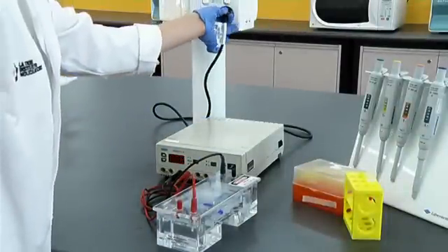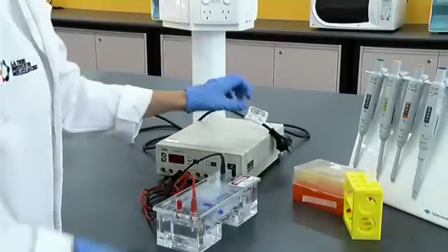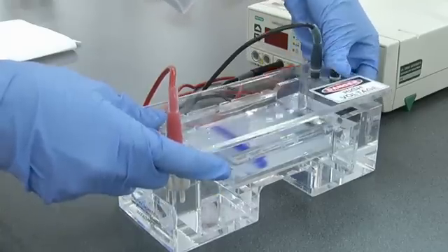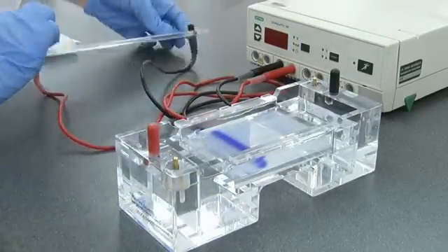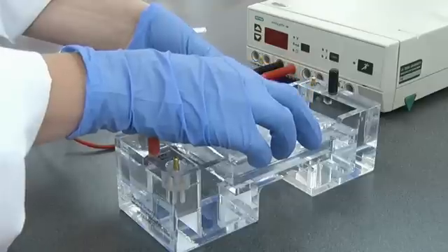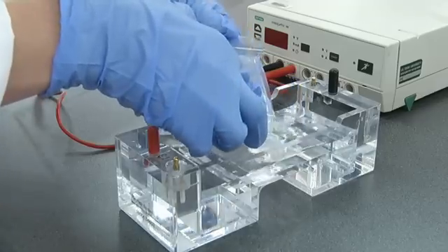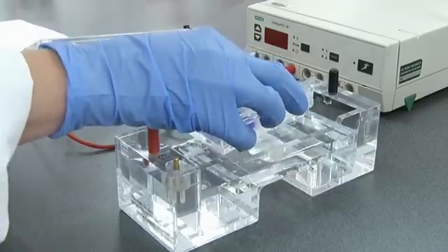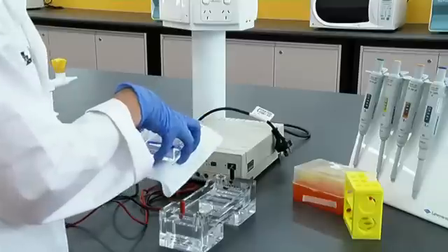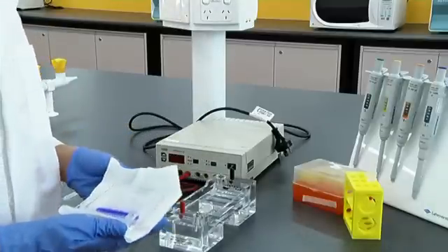You can then unplug the gel tank and remove the gel. Hold the gel tray by the ends to prevent the gel from slipping off the tray. You are now ready to look at your gel under the transilluminator.